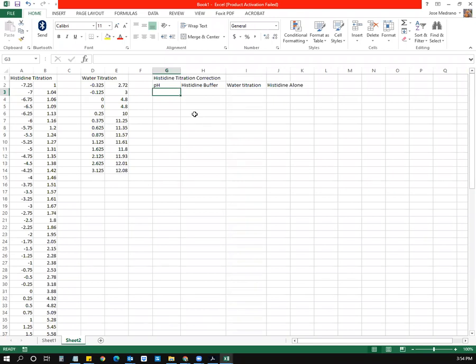This time, I'm going to show you how you can retrieve millimoles of titrant at your different quarter pH values for, I believe this is prompt B4. So from the plots of the titration of histidine and water from graph 1, make a new table that includes pH range 1 to 12.5 and a value of titrant millimoles for each quarter pH unit. And then you'll be able to do the water titrant subtraction from the histidine buffer titration, and just get the histidine alone titration.